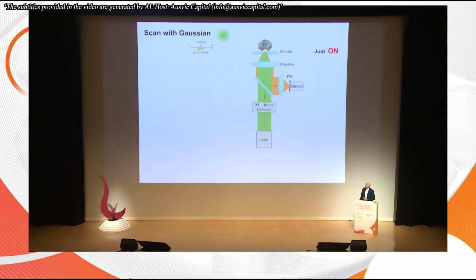Now, why did people say this doesn't work, separating molecules that are that close? Here they are very close, much closer than the diffraction blob that is produced by, say, a microscope in the focal plane of a lens. Say this is a confocal microscope, you have this blob of light. It's very simple. If you scan that blob of light across the two molecules, you will get a kind of Gaussian spot, and you cannot tell these are two molecules because this still looks like a single spot. If the two were at the same place, and you scanned again across it, this looks like this. There's hardly any difference. If you subtract the two, in fact, there is a subtle difference, but it's basically confounded by noise. It's all noisy, this difference.